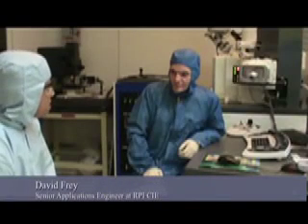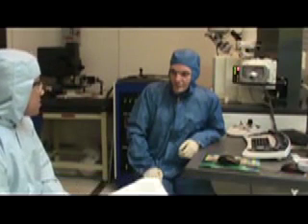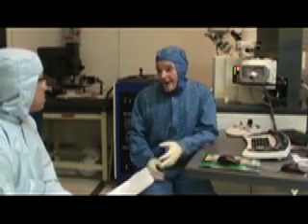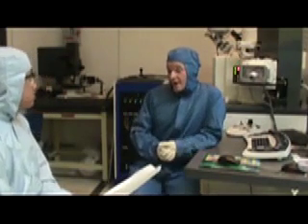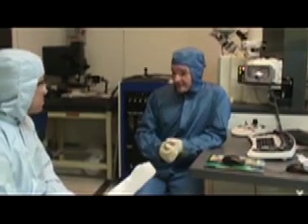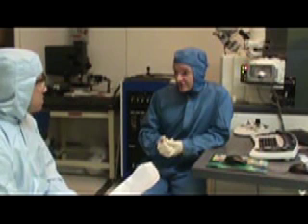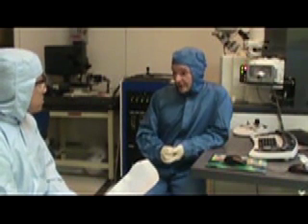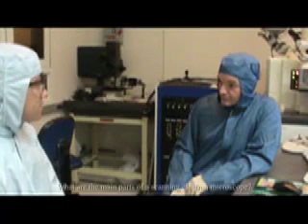Let's go to the clean room and talk to Lupin and Professor Fry. So, what is the main function of a scanning electron microscope? The main function of a scanning electron microscope is to actually be able to use electrons to image materials, and you can get very high magnification images with that microscope because of the very good resolution that an electron beam provides for you.